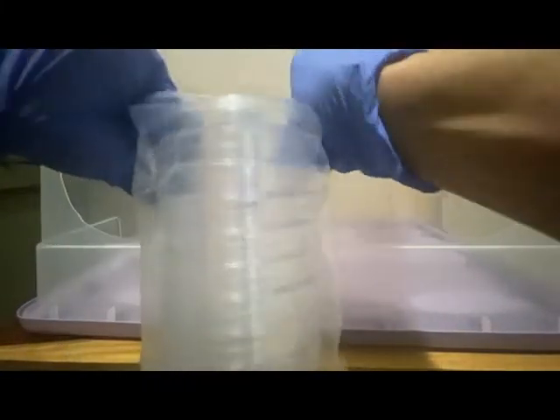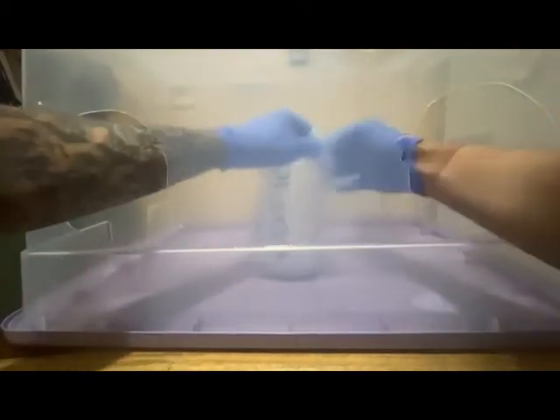First, we start by prepping. My preferred way of doing this is making sure that all the petri dishes are faced upside down. And do one of these little motions.